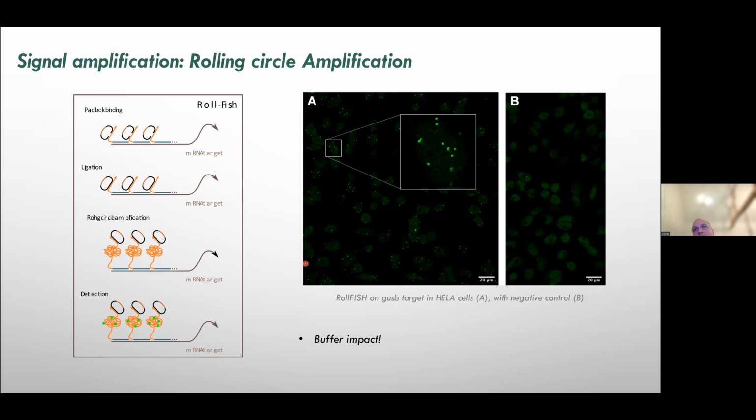What should be noted here is that all these things require secondary hybridization. So you have a system where everything is grafted to the gel, and then you want to have an oligo docking to another oligo. But these oligos don't like to dock at low salt concentrations. And this is actually what you need for expansion. So in all these cases, you should take into account that there is a hybridization buffer needed to allow for efficient signal generation.